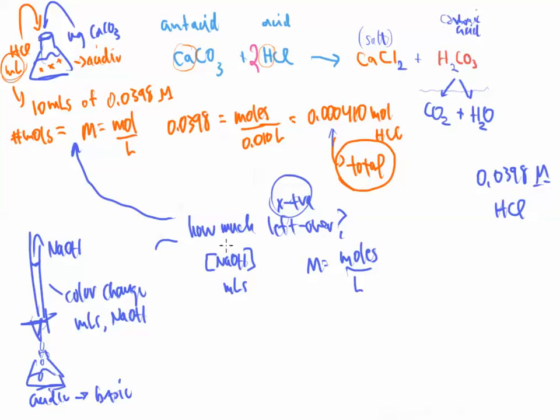Okay, so let's say that the concentration of my sodium hydroxide here is 0.1043. That came from a previous video.